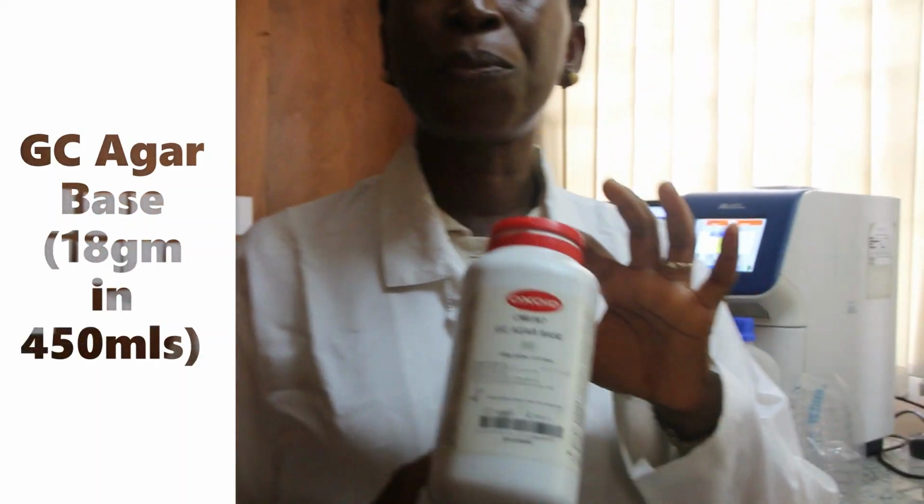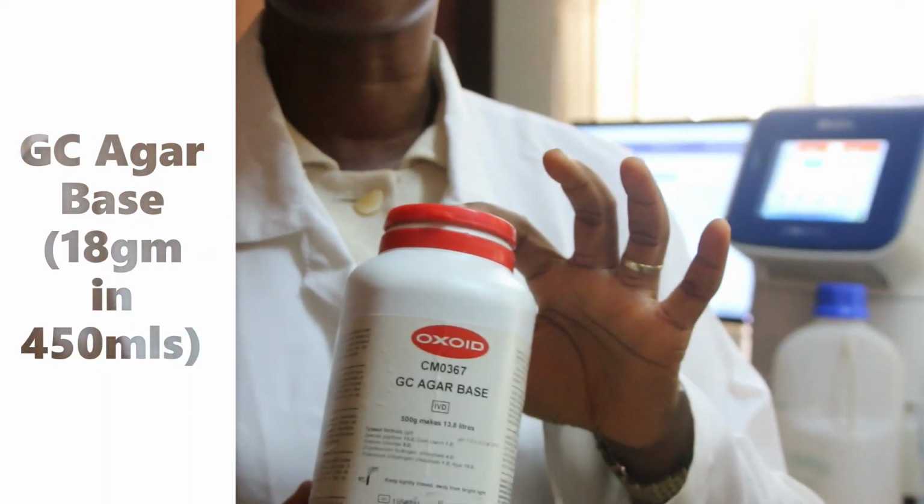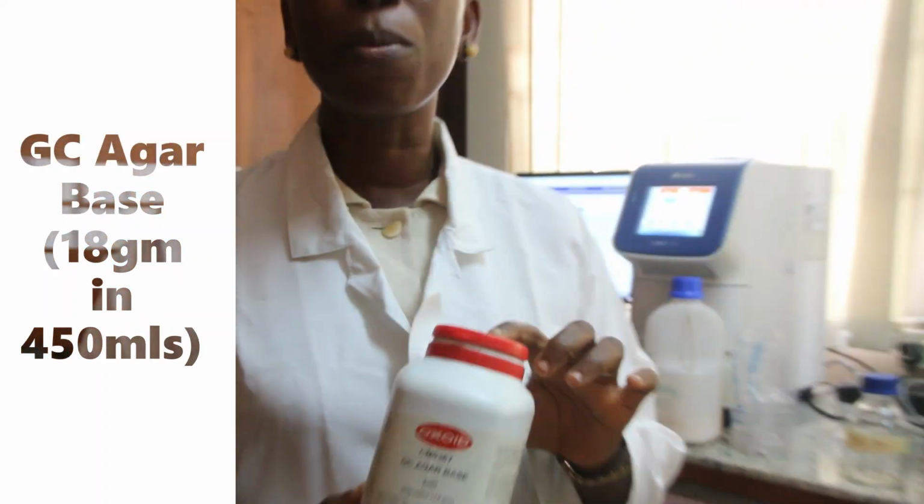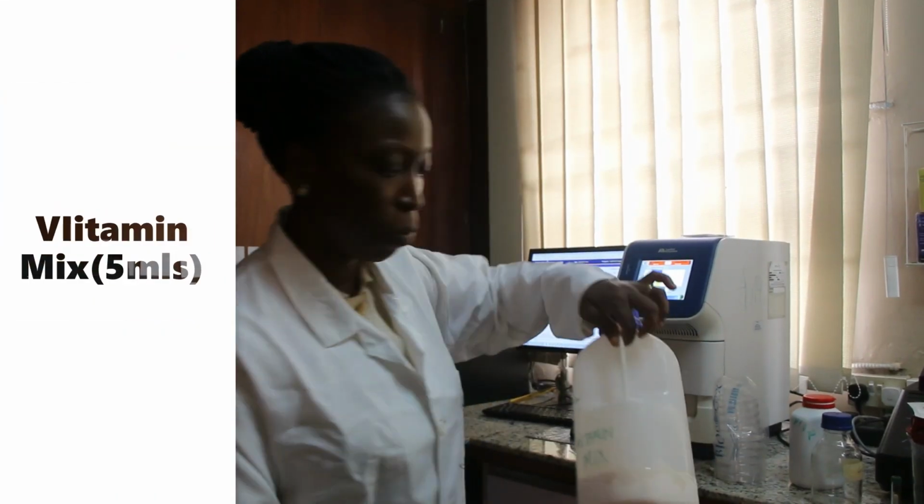GC agar can be prepared in a volume of 500 ml. 18 grams of the GC agar will be measured on a weighing scale into an autoclaving bottle, and 450 ml of sterile water will be added to the mixture and autoclaved. After autoclaving, nutrients such as a vitamin mix can be added.